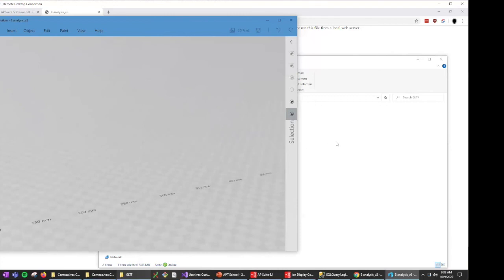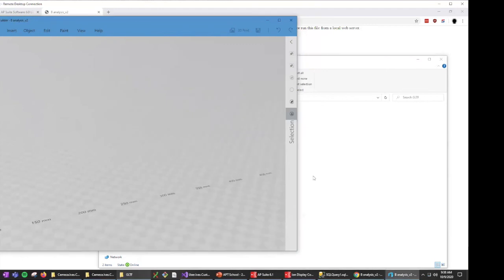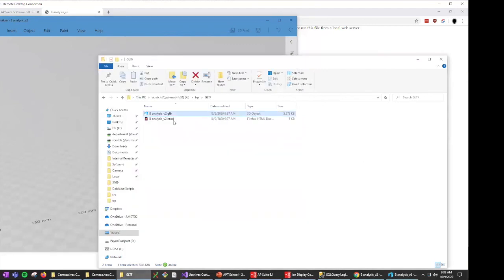I know that I've seen this working on Windows before, so I'm not sure what's wrong with my particular Windows 3D viewer that it doesn't see this. But don't worry. When Elon Musk wanted to showcase how tough his Cybertruck is, he smashed in the window as well, right? So that's what happens when you do untested things.